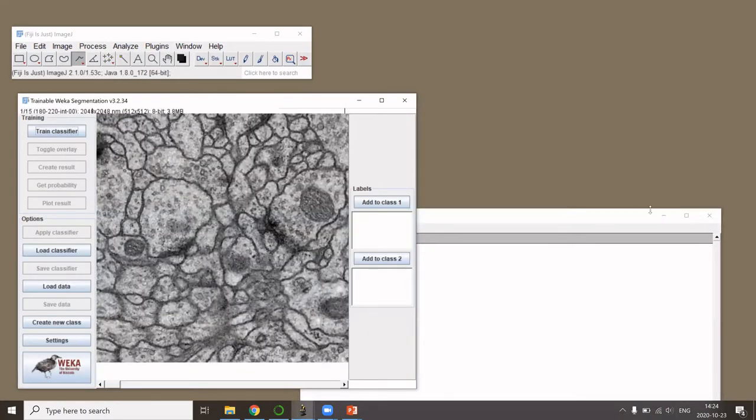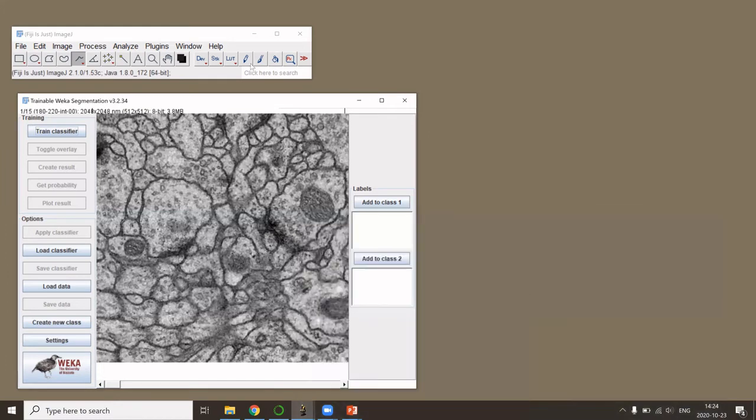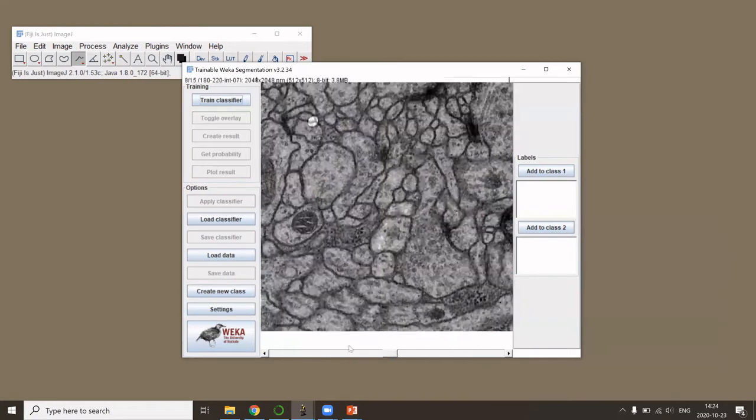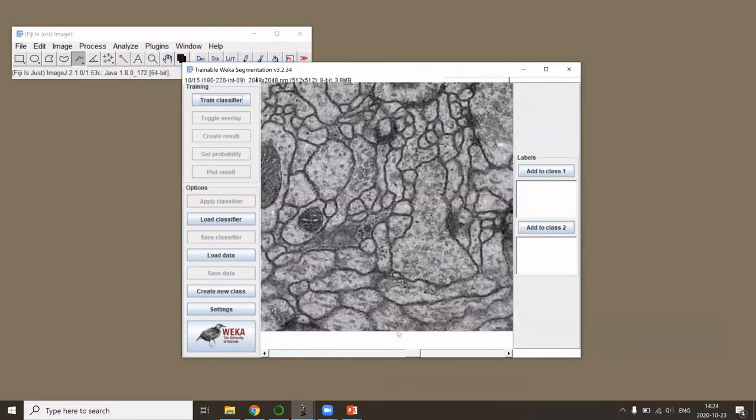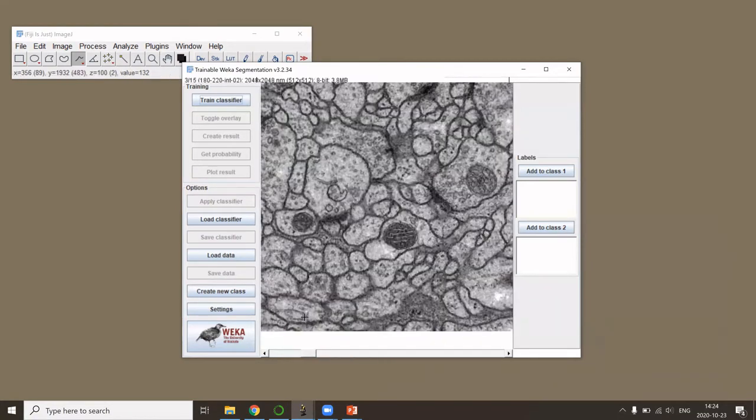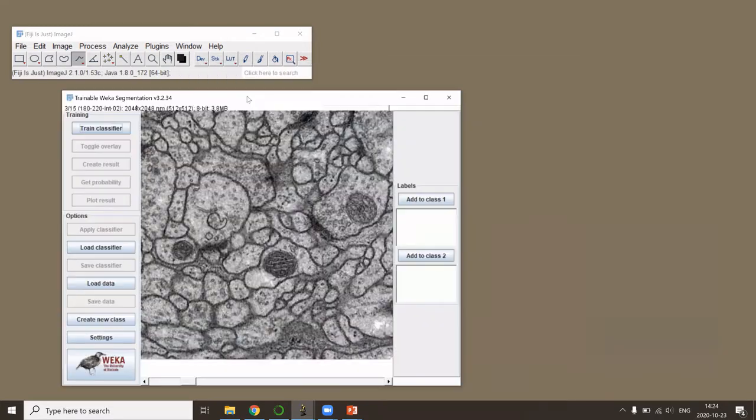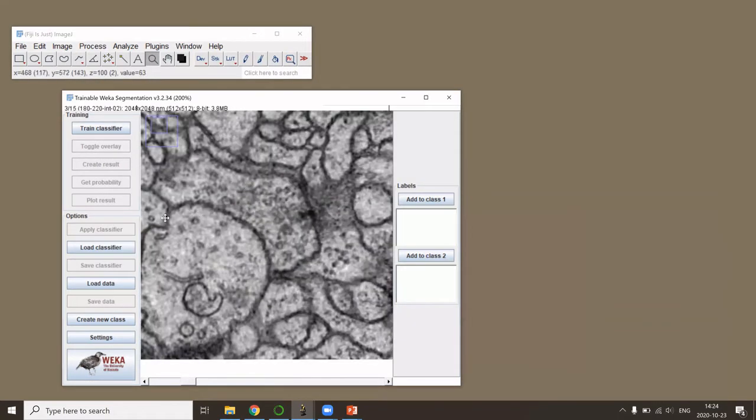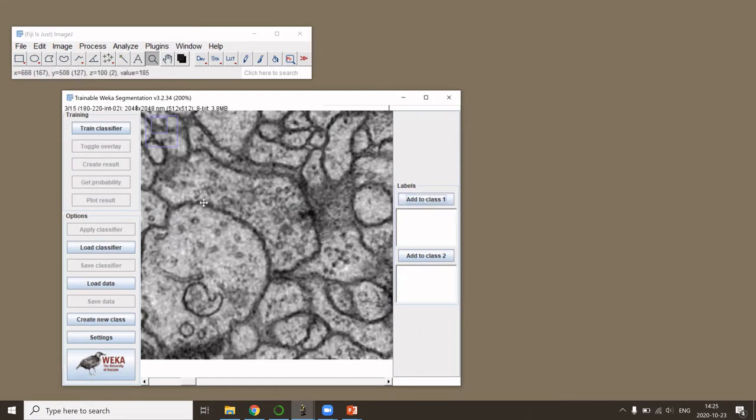Now the image or the entire stack is opened within the plugin's interface, so we can also scroll here. As in all pixel classifications, we need to train our classifier, saying which pixels are one class and which pixels are another class.